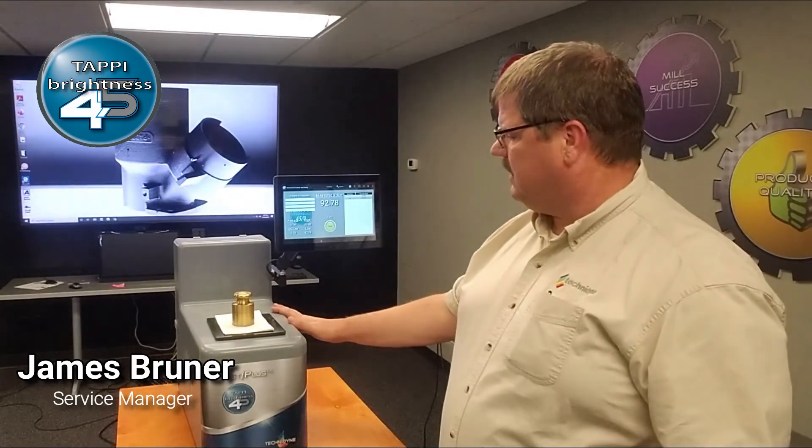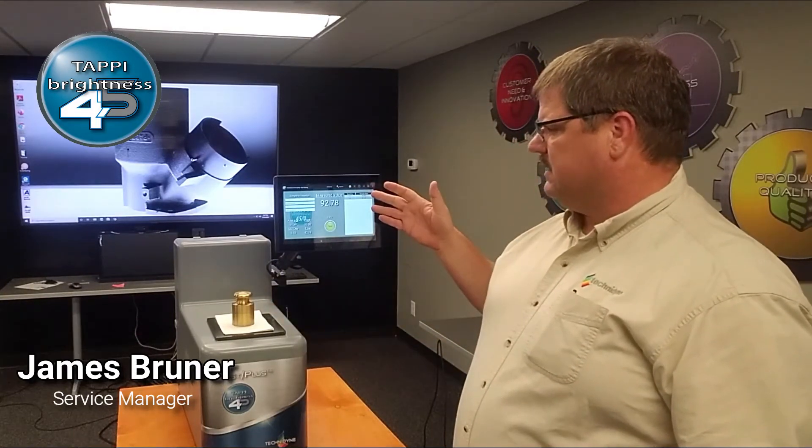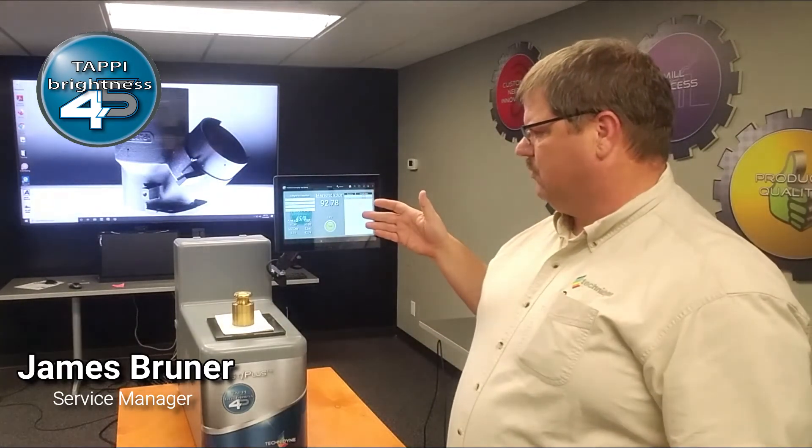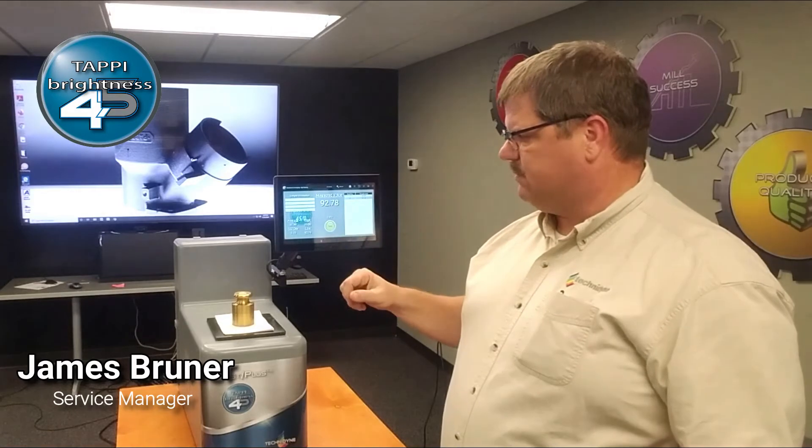This customer has taken the option of adding the statistics app. Here on the right side it will continue to record values unless a max number of readings has been set. The average will display on the screen along with the standard deviation.